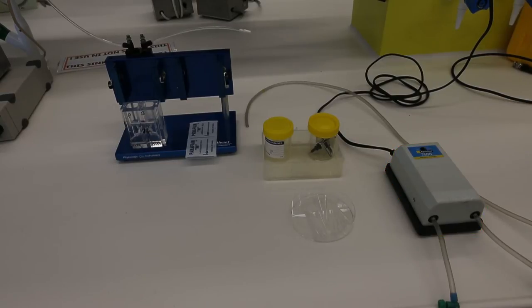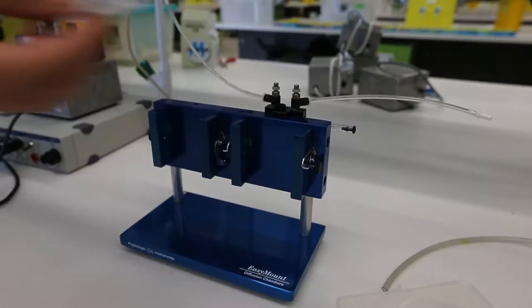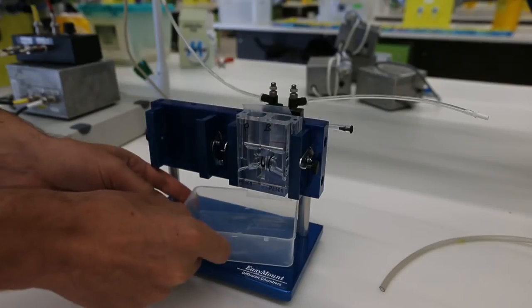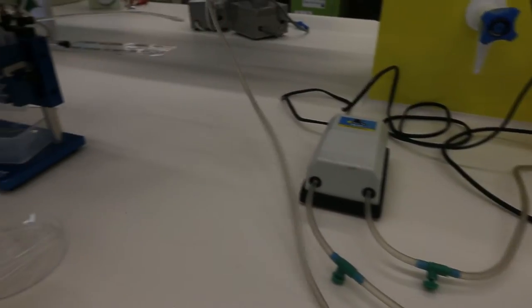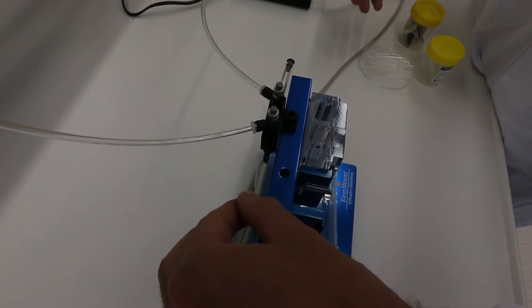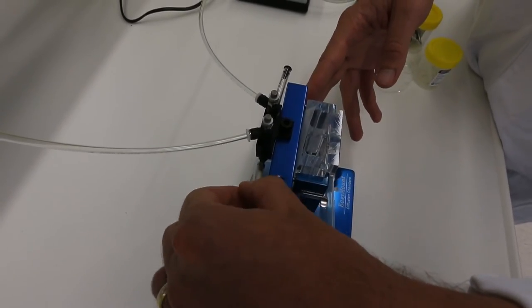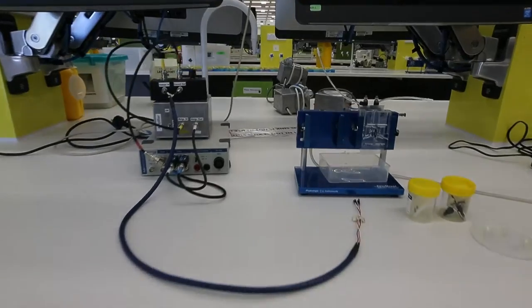To assemble the equipment, place the Ussing chamber on top of the parafilm and slide the unit into the easy mount frame, placing the container to catch the drips underneath the chamber. Next, take one of the tubes from the air pump and attach it to the easy mount frame as shown here. Your equipment should now look something like this.